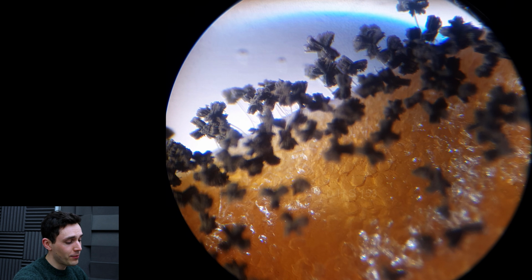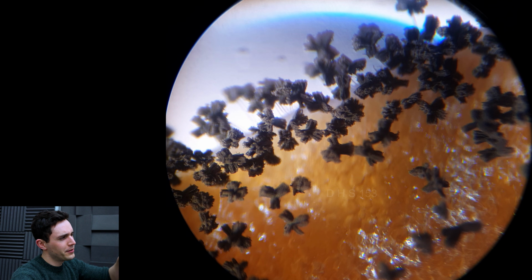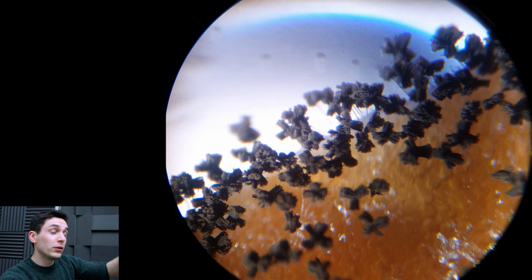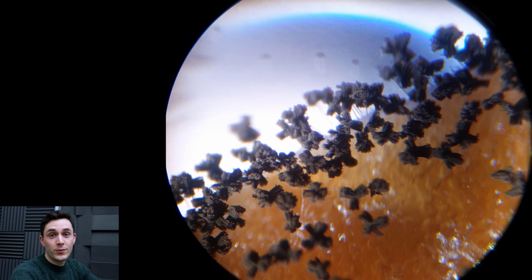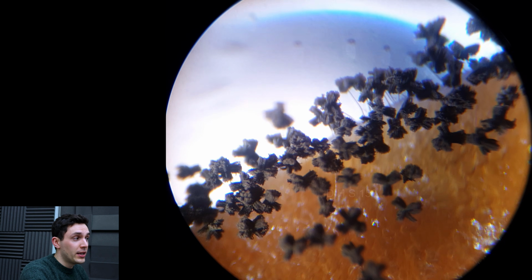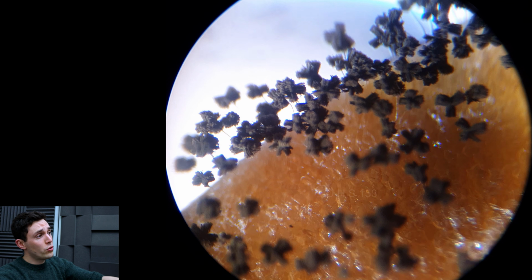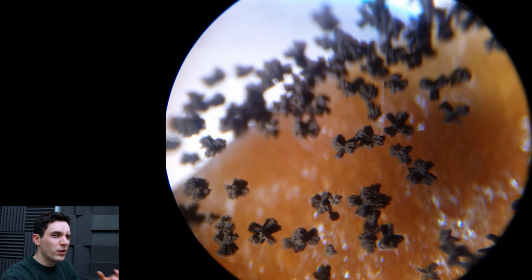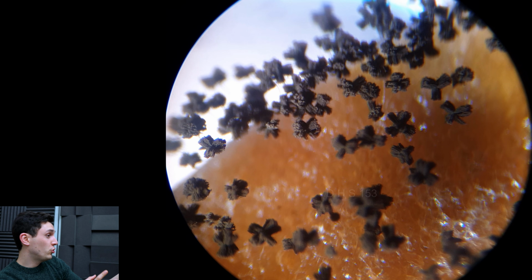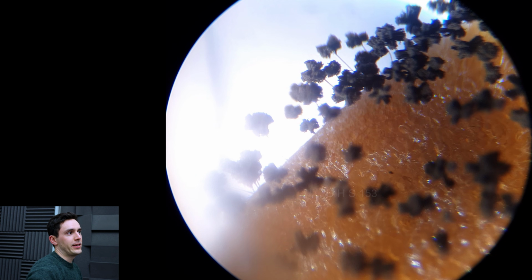So I thought I would give you an update just to tell you what happened. But it's a very nice shot here because, to the naked eye, or even through an endoscope, the spores of Aspergillus niger, or any Aspergillus fungus really, look like spherical dots or round heads. But as you can see, mature spores under high magnification aren't perfectly round. They actually look like little explosions. I'm guessing that when they're mature enough, they're under the weight of all the spores and just fall outwards. And that's what we're seeing.